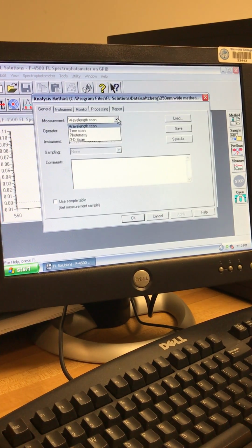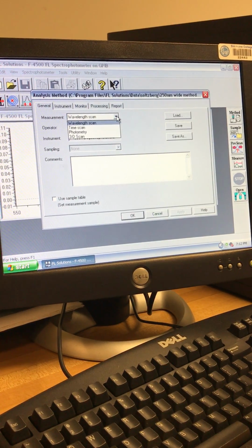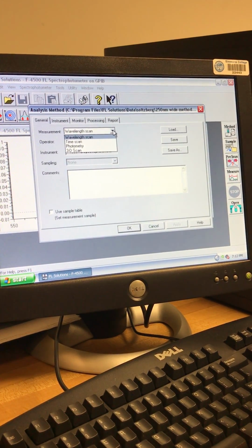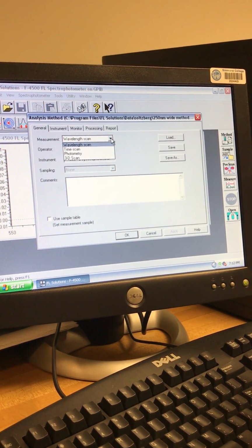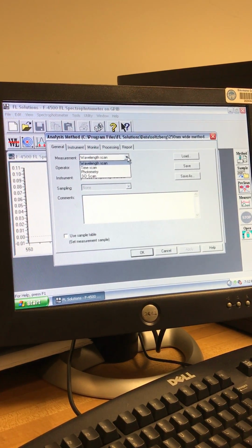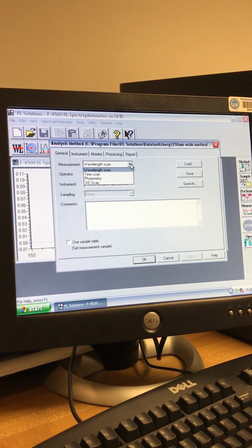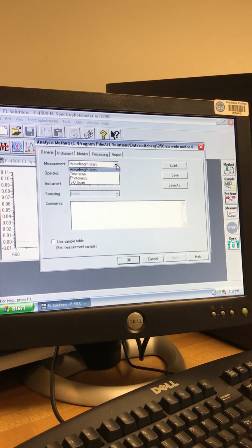You could do a kinetics experiment and measure time, and take time points that it'll automatically set up so you don't have to sit here and click it every so many minutes. And then there's 3D scans. Not sure what photometry is. Potentially, from what it sounds like, it's if you want to use excitation to create product. The final one, 3D scan, is if you want to actually scan excitation and emission at the same time and generate a three-dimensional plot, which is, as you change emission, take the excitation, excite, take the emission, excite, take the emission, and generate a 3D plot.